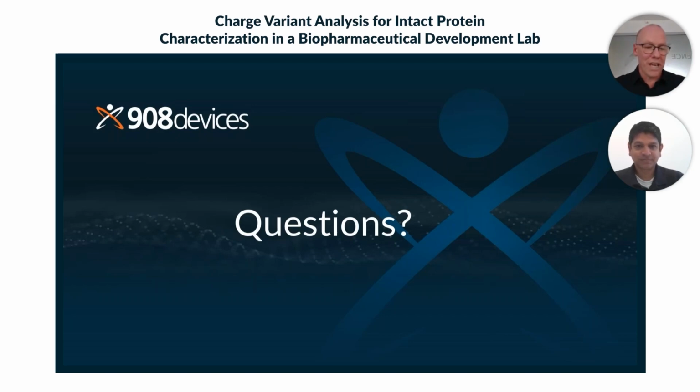And it's really fast for that. You can also do denaturing separation under more acidic conditions than we do. We really like the native because it gives you a nice and clean mass spectrum, because you have fewer and lower charge states, so they're moving up into the higher m/z range where you generally have less noise. So we're in love with native MS in all its shapes and forms, and yes, the zip chip is one of the applications for native MS.